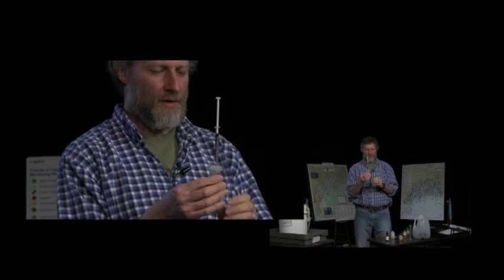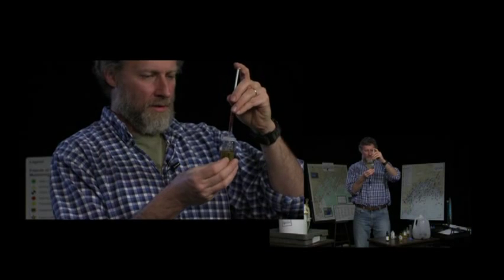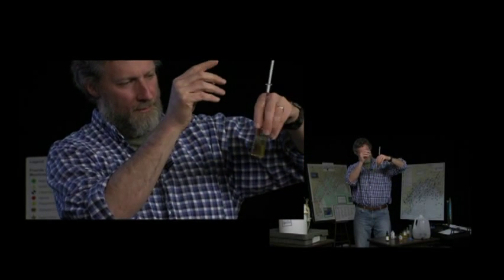We'll firmly put the syringe in the top, and we'll add a drop. Mix it.